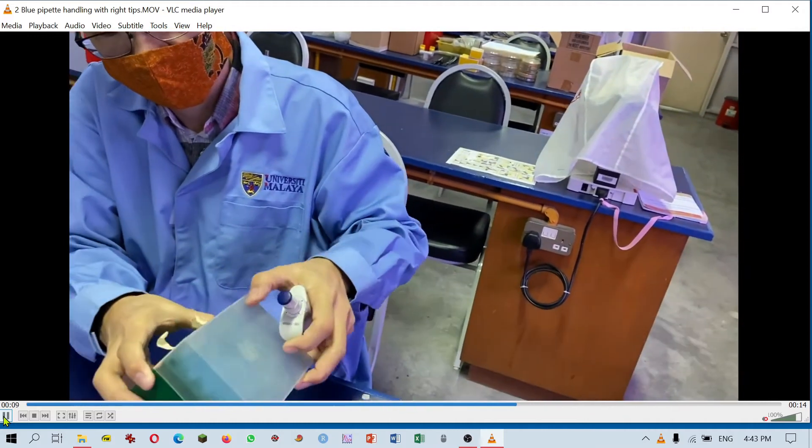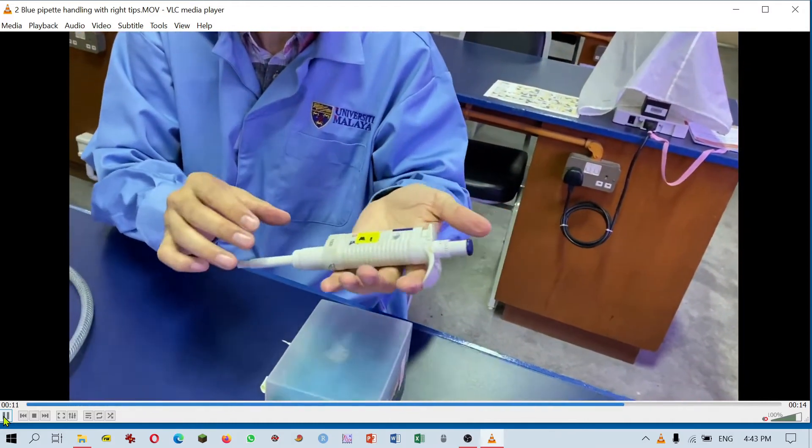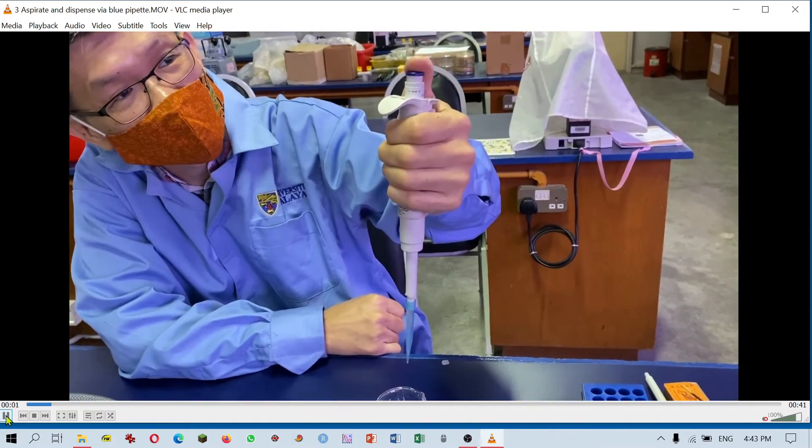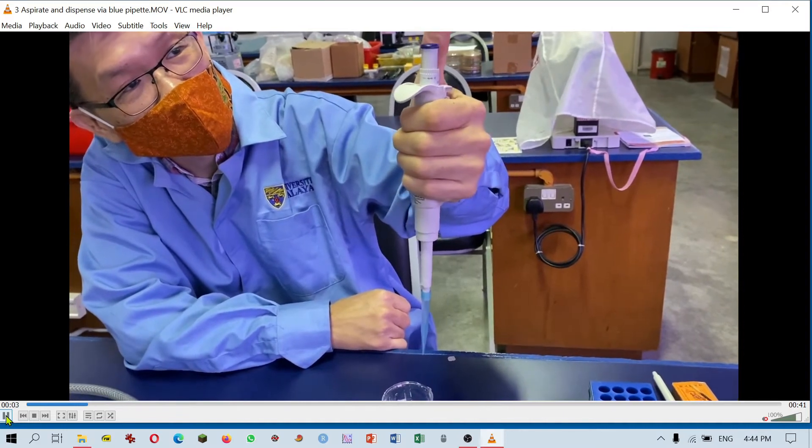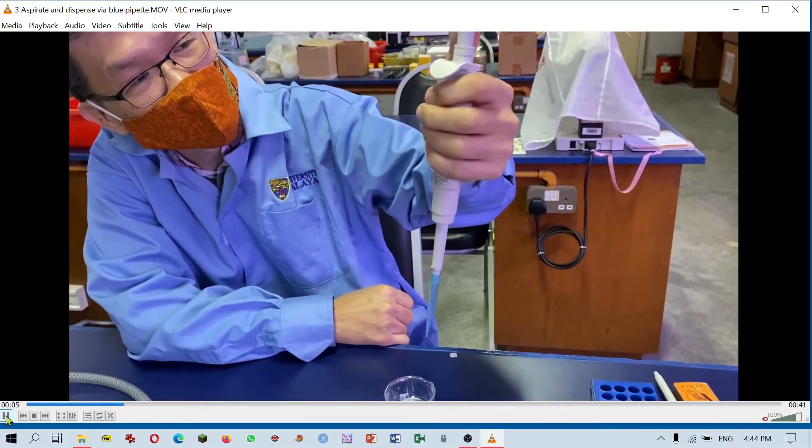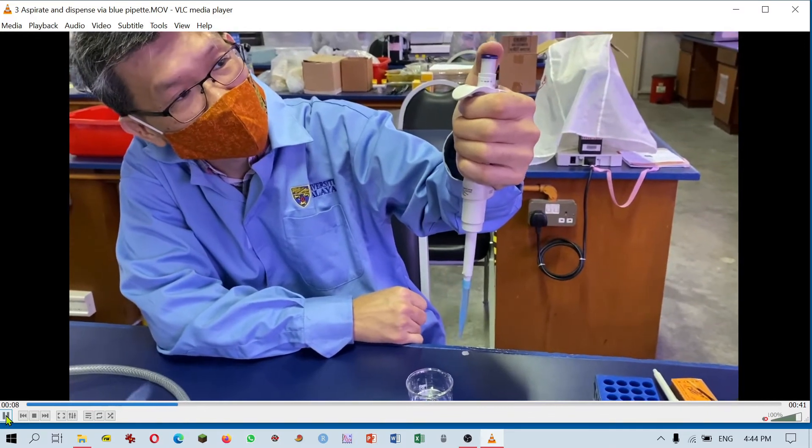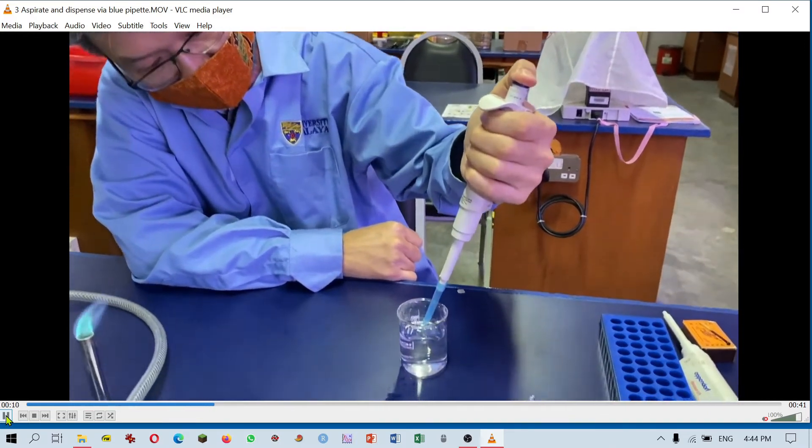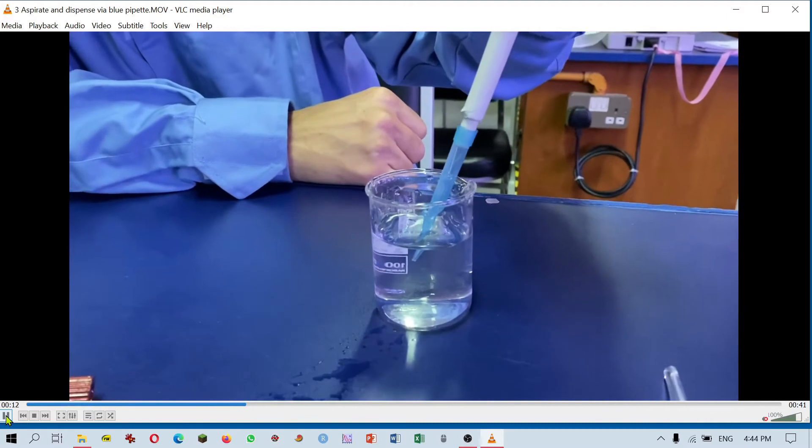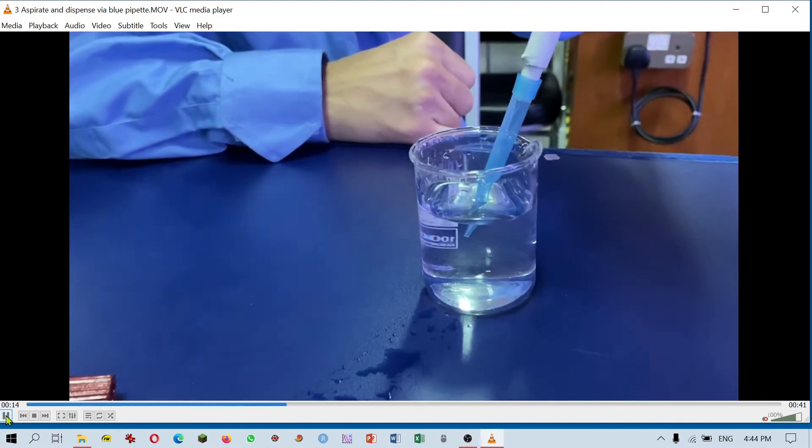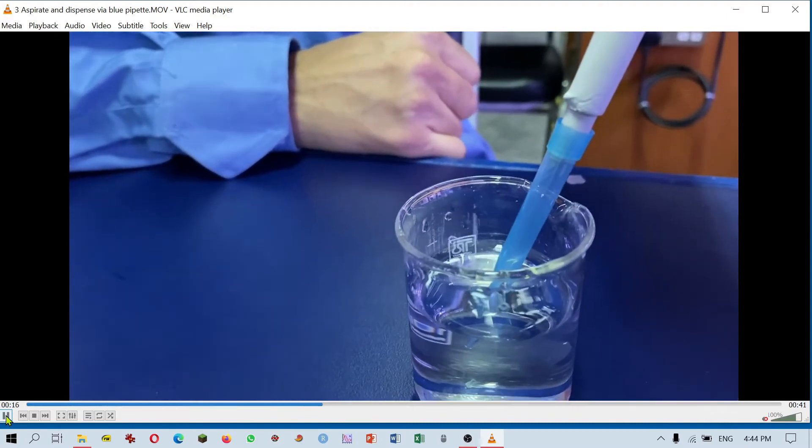As with all micropipettes, there are two stops. Take note that there are two stops. The first stop is for you to aspirate your solution by slowly releasing the button.